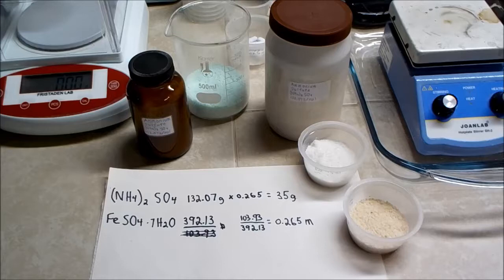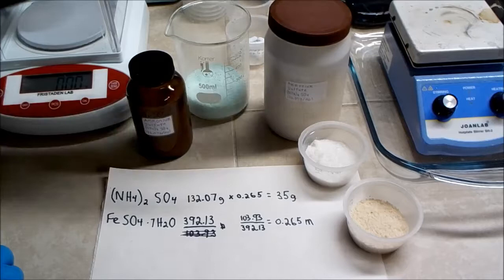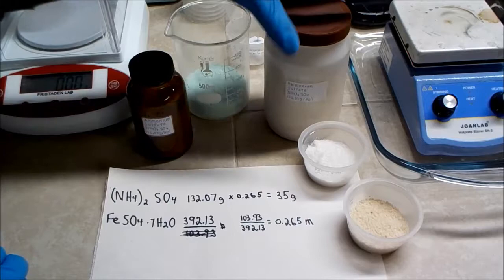So Mohr salt, it's simply the combination of equal molar amounts of iron sulfate and ammonium sulfate. Now, ammonium sulfate is easy enough to make, but you can also buy it very easily. It's sold in garden stores as a fertilizer.